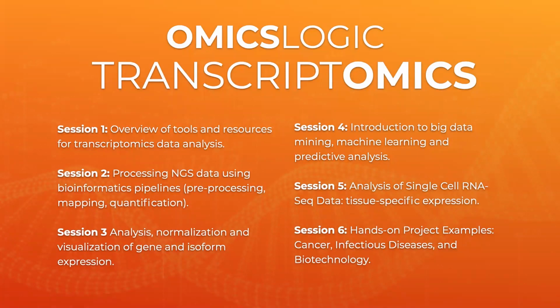In session 5, we'll speak about the analysis of single-cell RNA-seq, how we can analyze single-cell data, so what kinds of pipelines and standard packages exist for the analysis and the processing of that data, what are some of the challenges associated with RNA-seq data, what are some examples where analysis of single-cell data have proven to be insightful and important, and also discuss tissue-specific expression.